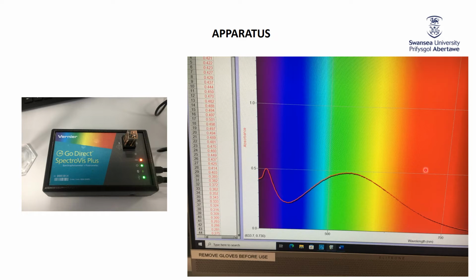Okay, along the bottom there is the wavelength of the different types of visible light. We've got this pretty little background that shows you that the shorter wavelength, or the higher energy visible light, is purple, and then of course you get that famous sequence going through violet or purple, then blue, then green, then yellow, then orange, and then red. And this of course is the longer wavelength or the lower energy end of the visible spectrum.